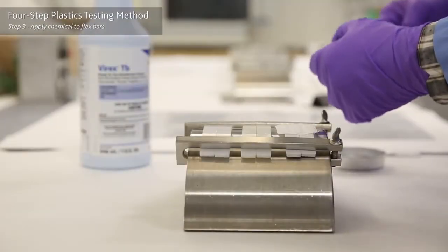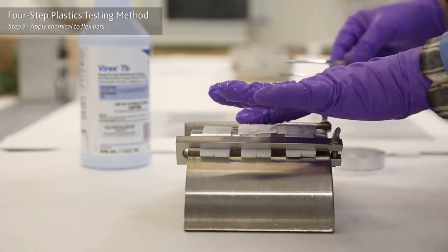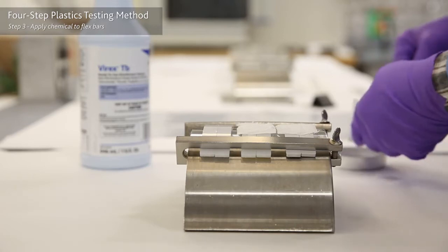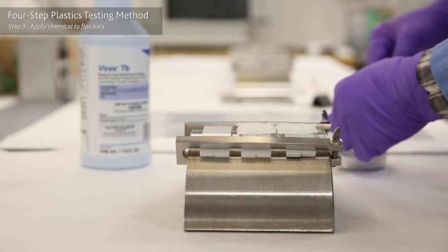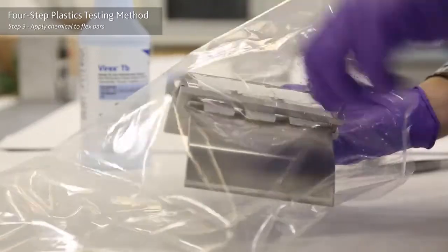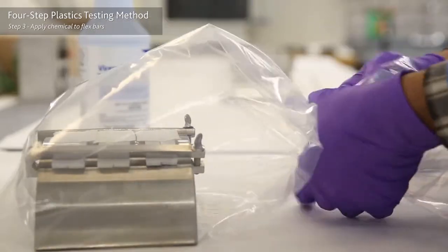Step three: apply chemicals such as commonly used hospital disinfectants, lipids, and drugs or drug-carrying solvents to the flex bar using a pre-soaked piece of cotton. Enclose the entire sample jig in a plastic bag to prevent evaporation and leave it at room temperature for 24 hours.